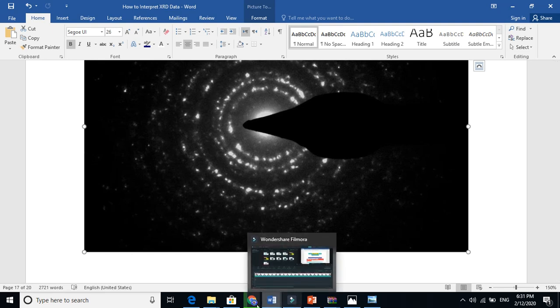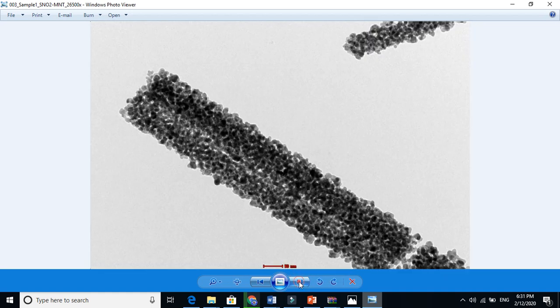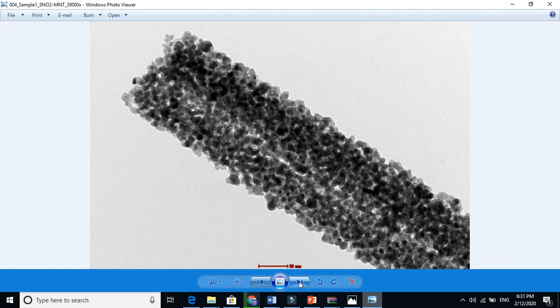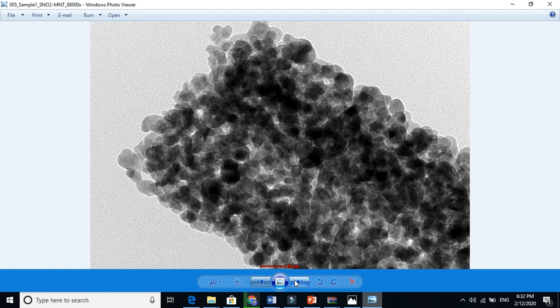Let us now look at a few more TEM micrographs. Here you see nanofibers at 200 nanometers. When you zoom in, you can see differences and observe the porosity of the structure, because light appears to pass through. The white areas indicate that this structure is porous. Zooming in further, the grains and crystals become clearly visible.